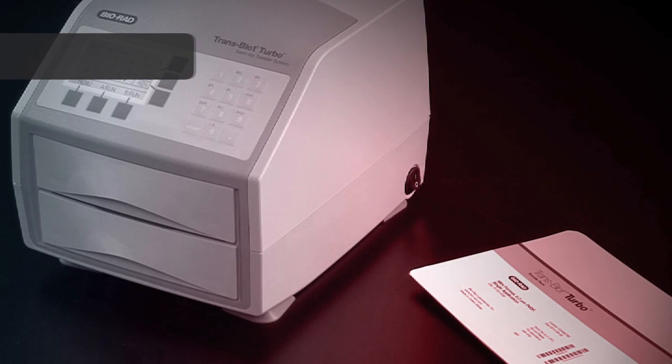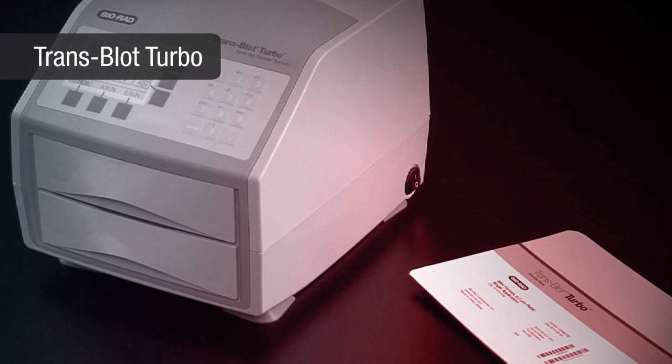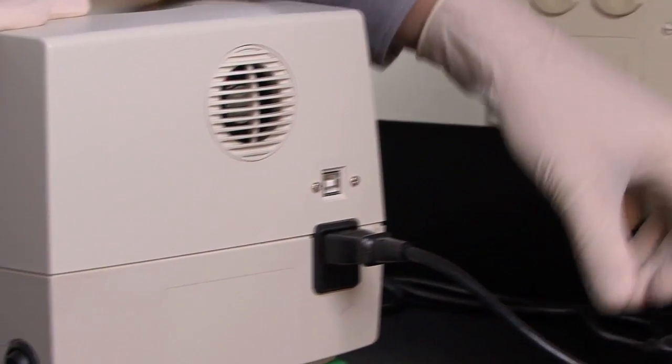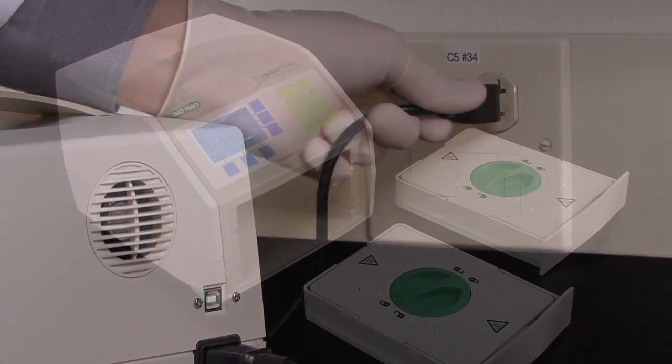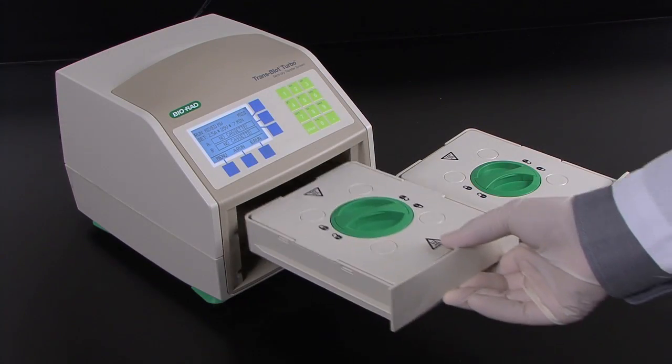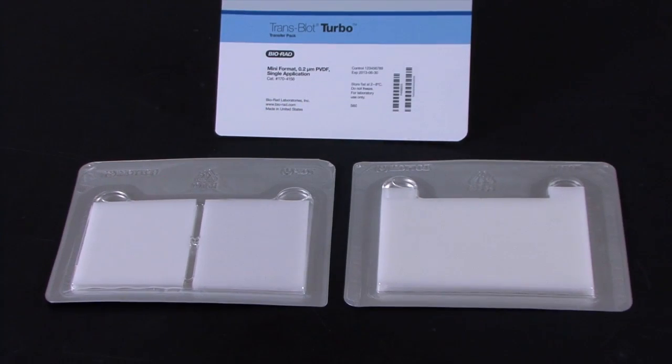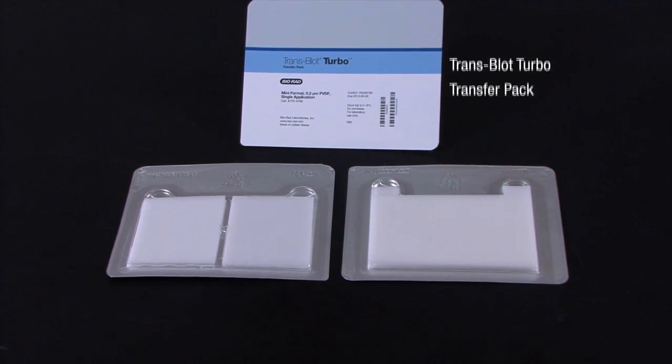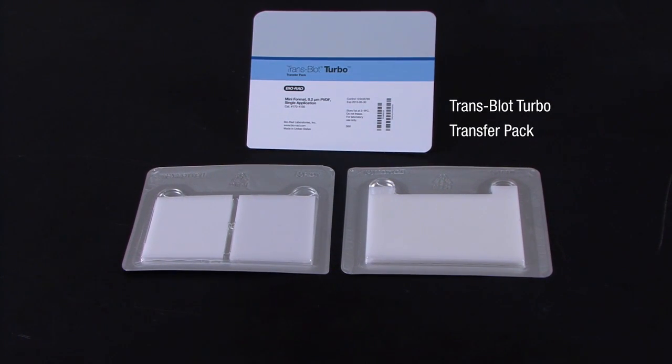The Trans-Blot Turbo system, on the other hand, requires only two items to transfer your gel: the Trans-Blot Turbo unit and a Trans-Blot Turbo transfer pack. The Trans-Blot Turbo unit contains an integrated power supply and has two transfer cassettes. The transfer packs contain a membrane, buffers, and filter paper all in a single ready-to-use package.